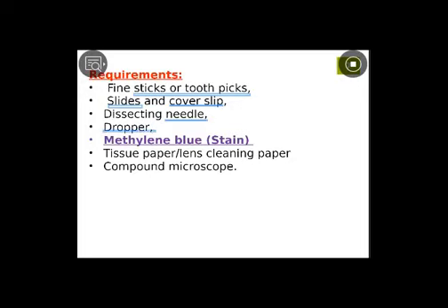But the most important thing to understand is this. Dear student, this is very important from the examination point of view, because in the exam I can ask this. What is this? This is the name of the sabagha. Today we are using a sabagha, yani stain. We want to give color to the cell, because our cells are shaffaf, transparent.